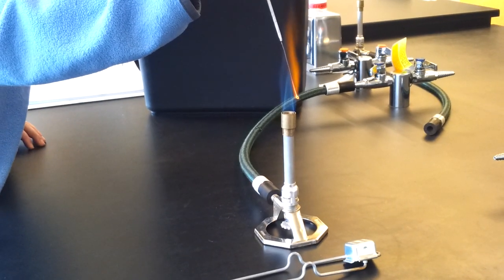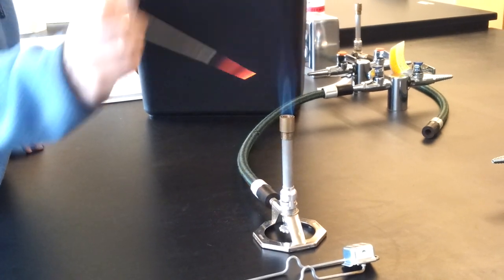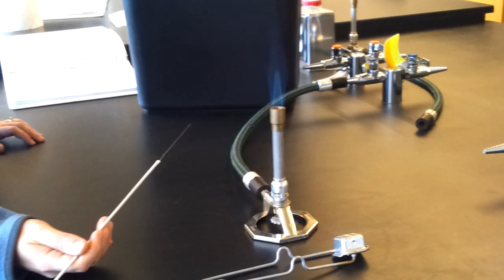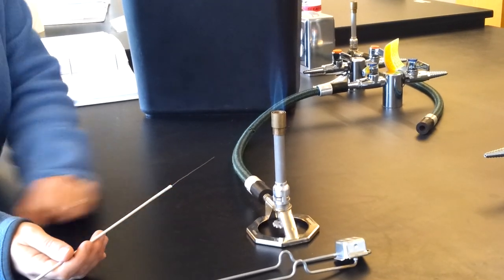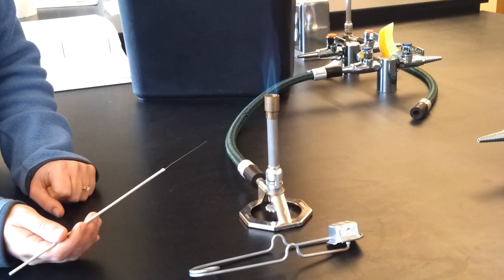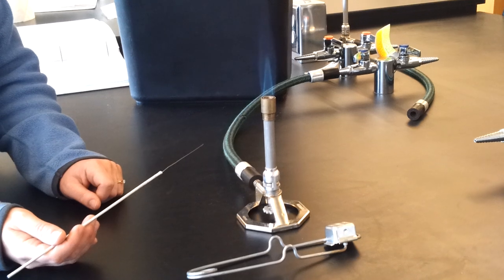So somewhere right about here is where you want to hold your loop. If you continue to have troubles getting the whole thing orange, it could mean that your loop is bent, and you can either try to bend it back until it's straight or just get a different loop. If it's curved, you will have more trouble sterilizing it.